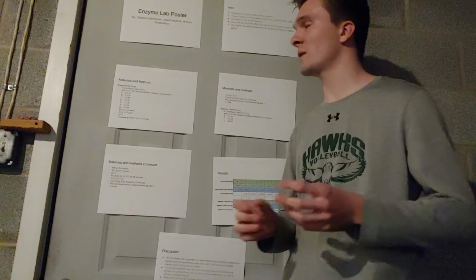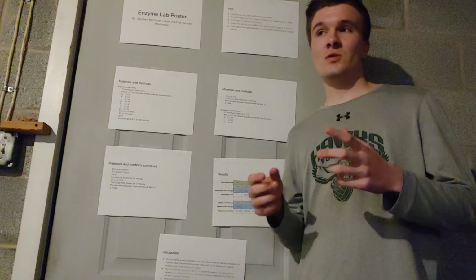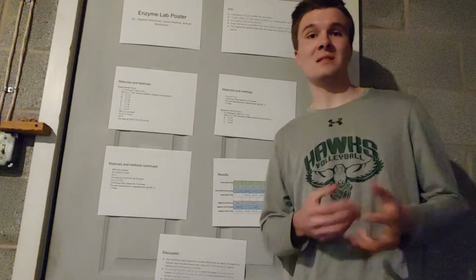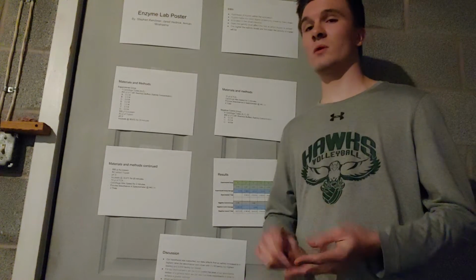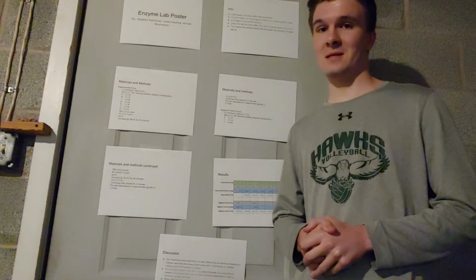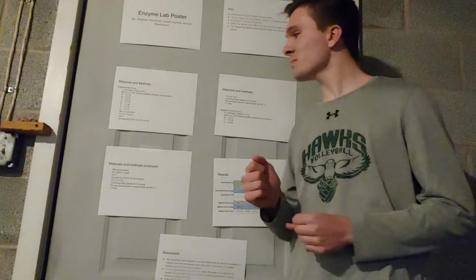And so for our actual experiment, what we had was 7 centrifuge tubes, and we filled those with different buffers of salinity. So this ranged from 0 to 4.8. We're expecting the 0 to produce the most, and then 4.8 to produce the least, and everything in between. The exact salinities for the 7 centrifuges we used were 0, 0.3, 0.6, 0.9, 1.2, 2.4, and 4.8. And then I'll explain in a second which ones of those we used for our negative control group.